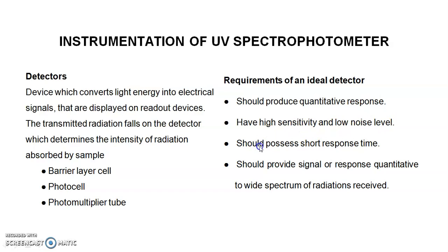Another requirement is that it should possess a short response time. Rather, it should not take too long to respond, but it should take very short response timings. And also, the detector should provide signals or response in a quantitative way to a wide spectrum of radiations that are being made to fall upon it.